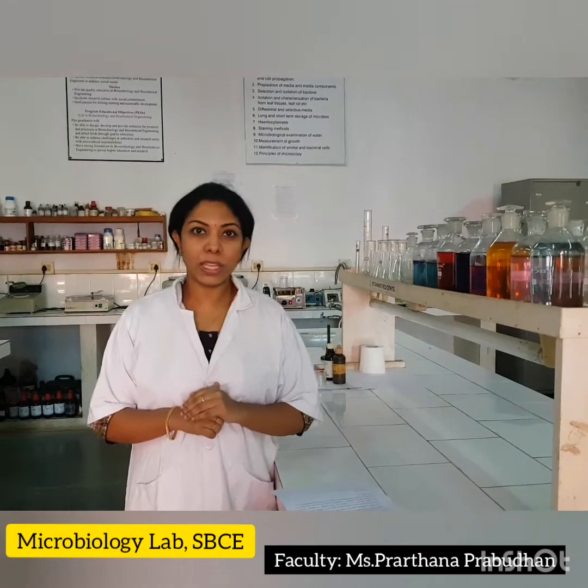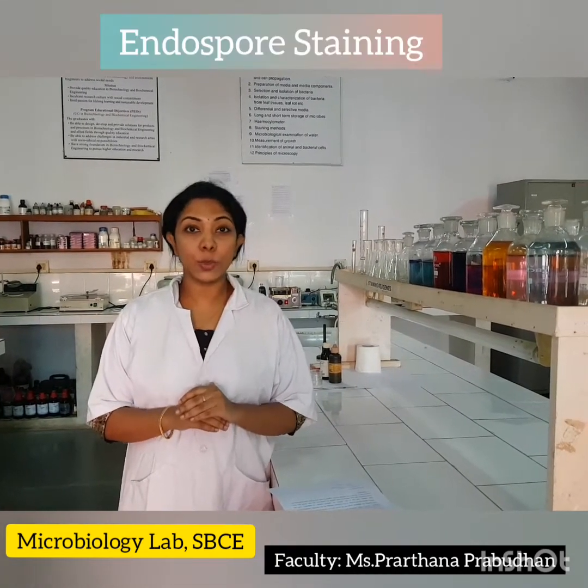Hello students, welcome to the Microbiology lab. Today's experiment is endospore staining.